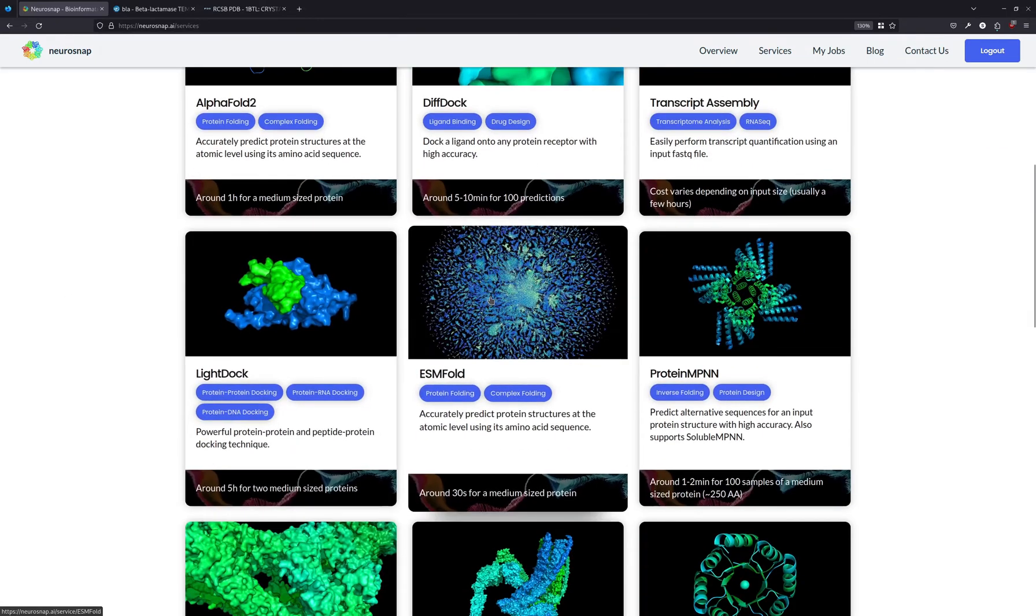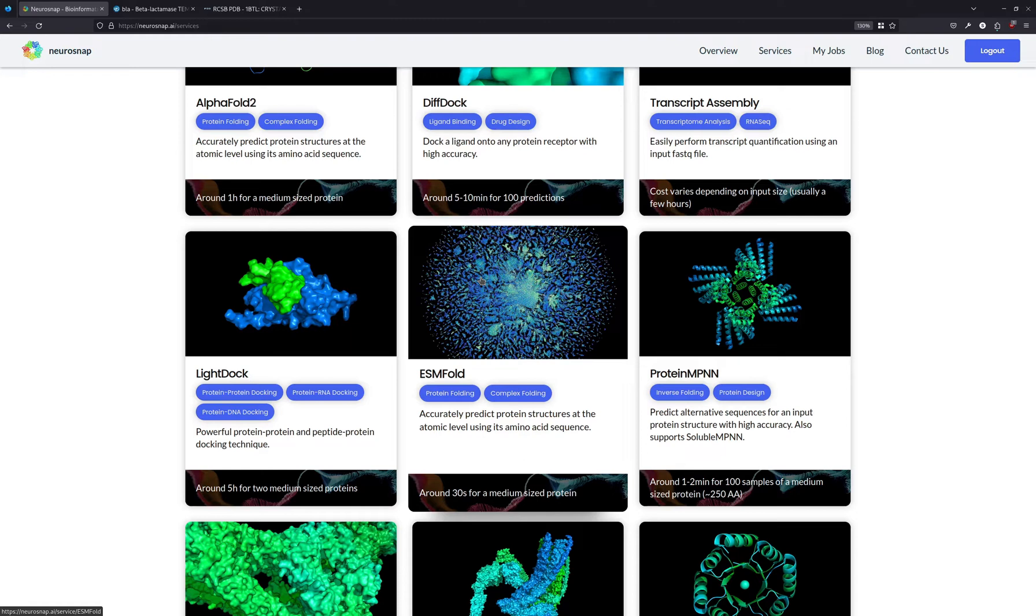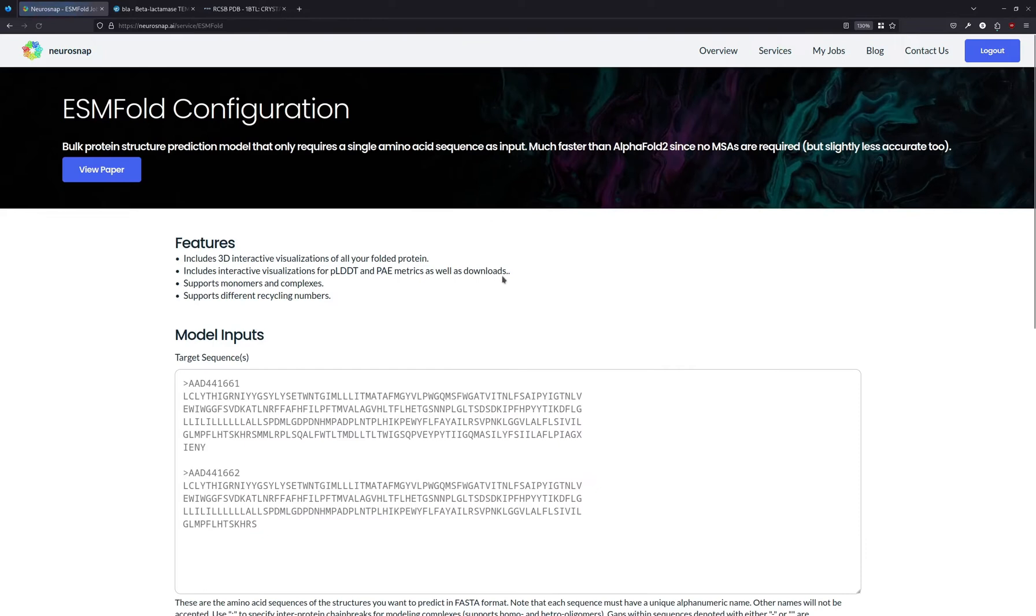NeuroSnap is a platform that offers a lot of different machine learning tools for bioinformatics and biology. ESM Fold is one of the services being offered on the platform right now, and it's totally free to use.